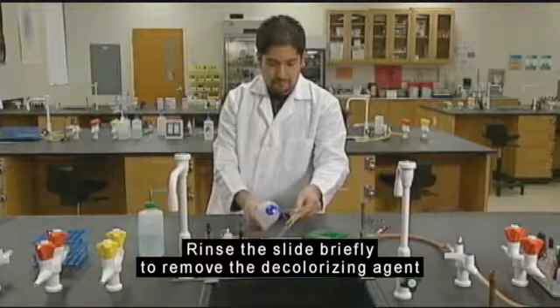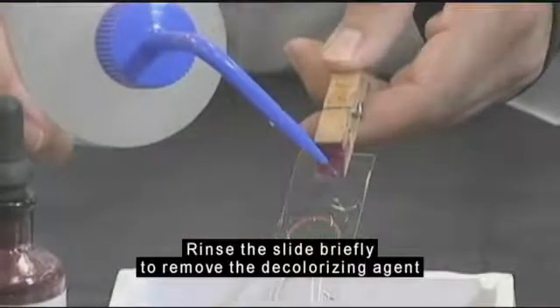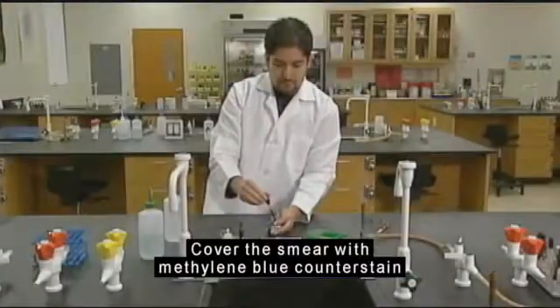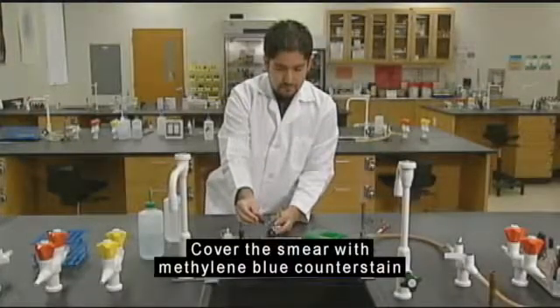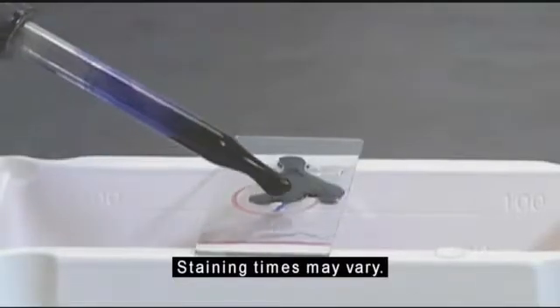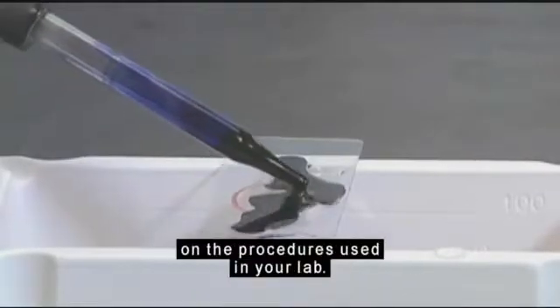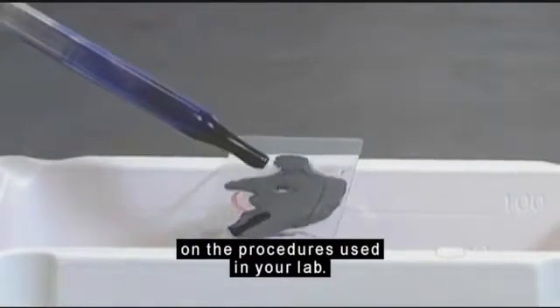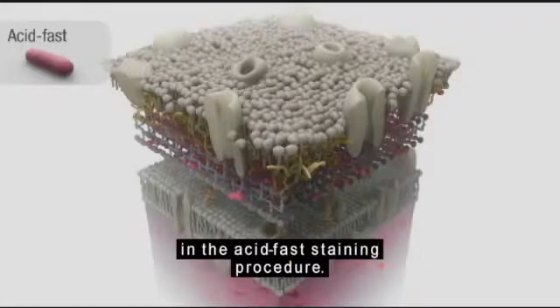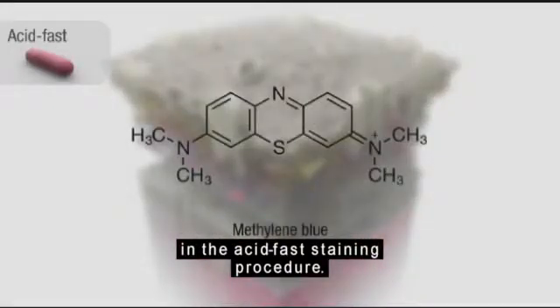Rinse the slide briefly to remove the decolorizing agent by letting distilled water wash over the slide. Cover the smear with methylene blue counterstain for 1 minute. Staining times may vary. Your instructor will provide details on the procedures used in your lab. Methylene blue is used as the counterstain in the acid-fast staining procedure.